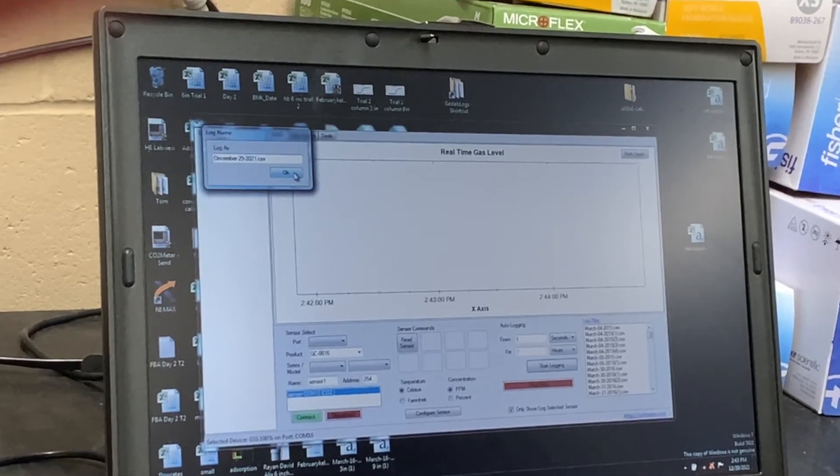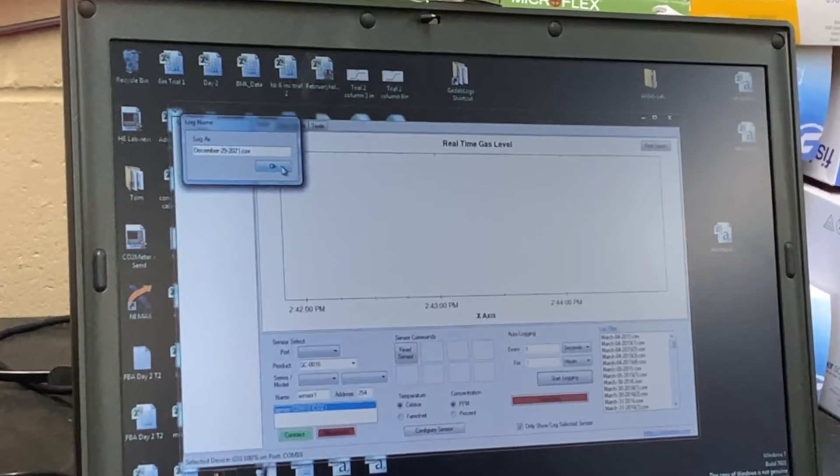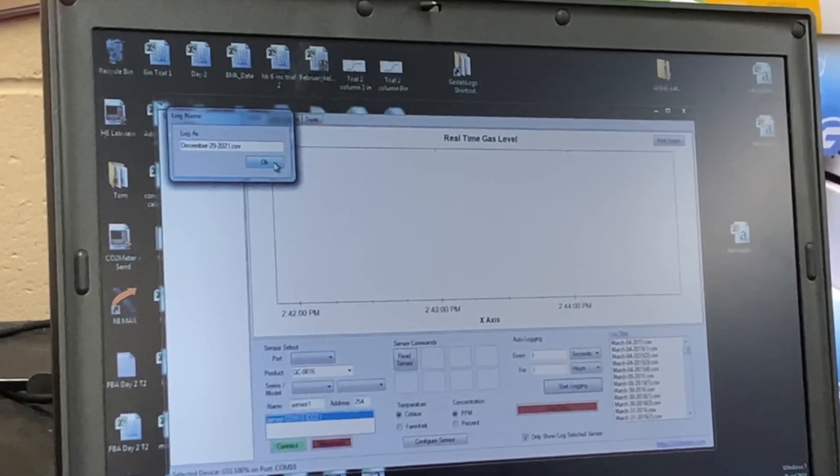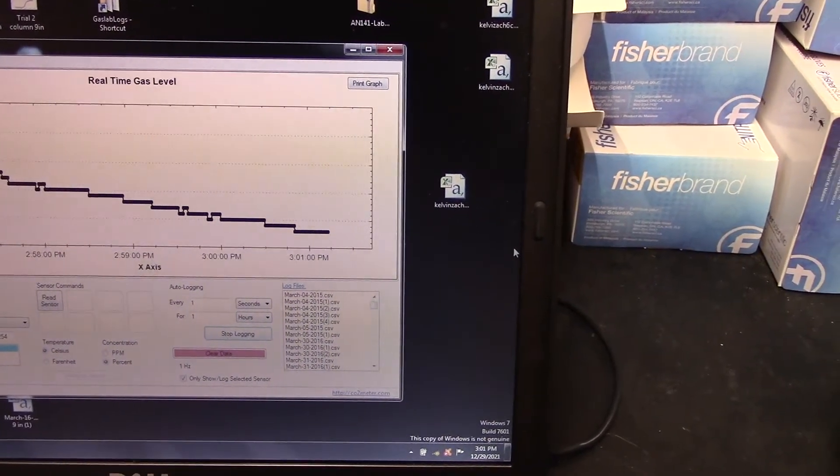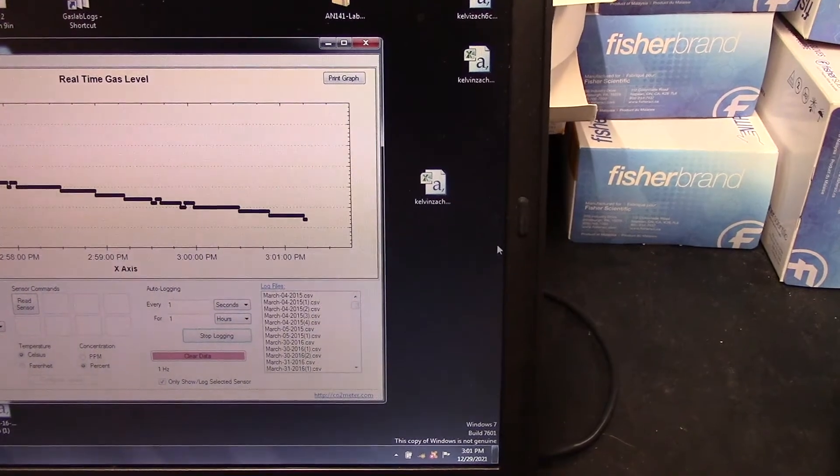Important to note that students should not select to append and should instead always start a new file with a new name. Continue running the system until the carbon dioxide concentrations level off.